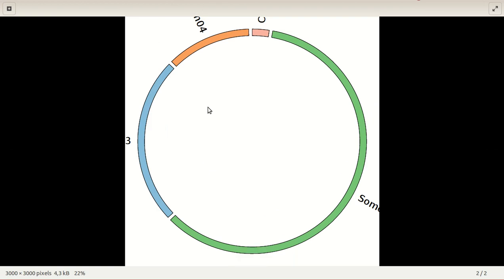So you can see here that first, the labels are not parallel to the karyotypes, so they are just pointing outwards, and they don't fit in the image. That's one thing. Another is that the labels are bigger. So let's say that actually we want to keep the changes, but they don't fit in the image, right? So let's make the background bigger.